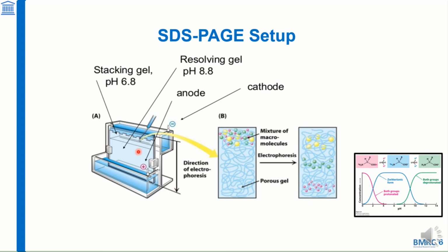In this environment, there is no longer any ionic pull for migration of protein. Hence, the proteins will migrate according to their weight. The lighter proteins will migrate faster, and the heavier proteins will drag behind, causing a smooth separation of proteins by weight.